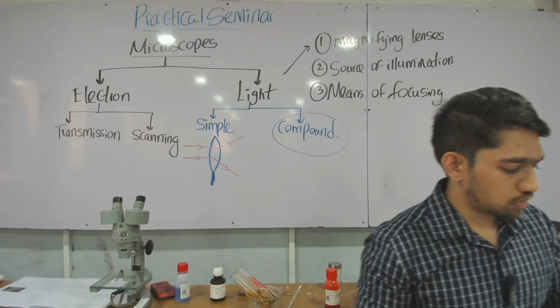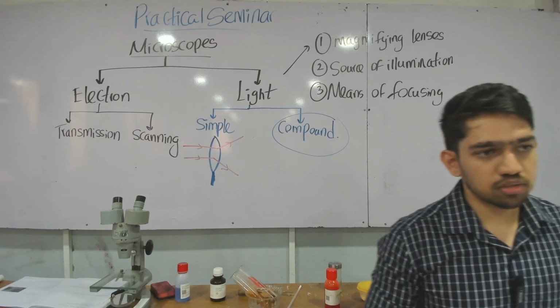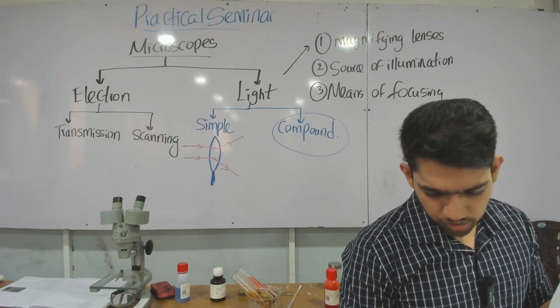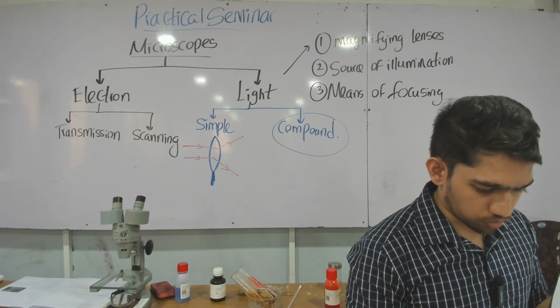You can see the unaided eye covers the range down to about 1 millimeter. That depends on person to person as well. So the unaided eye stops there.